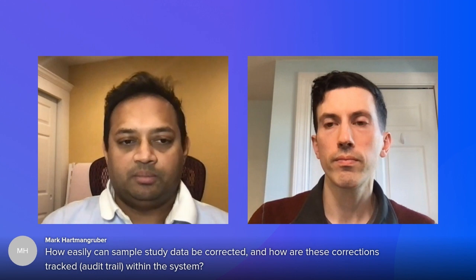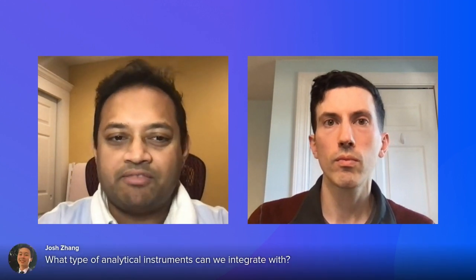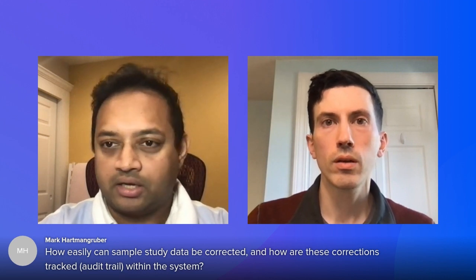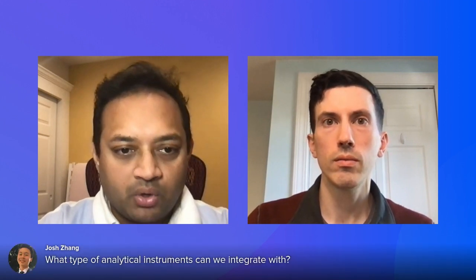Yeah, exactly. So basically, everything on Benchling is tracked, right? Audit trail, even though, yeah. So that, in addition to the archival system, we have one more question.